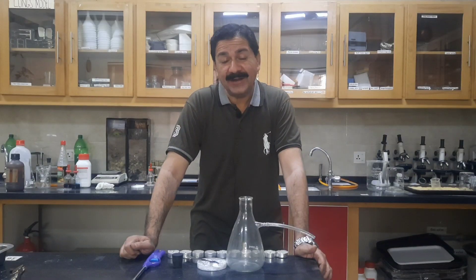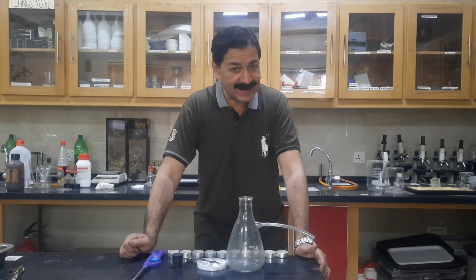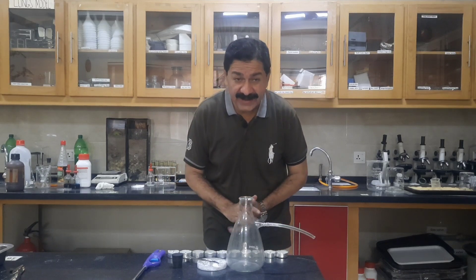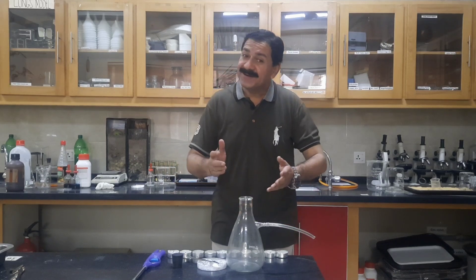My name is Asif Umar and our today's activity is making carbon dioxide gas. I am going to prove that carbon dioxide gas is a fire extinguisher and we will also do the lime water test.